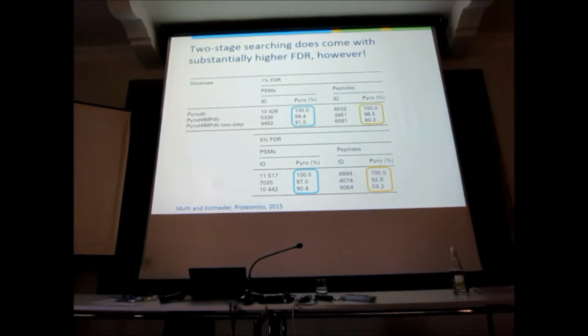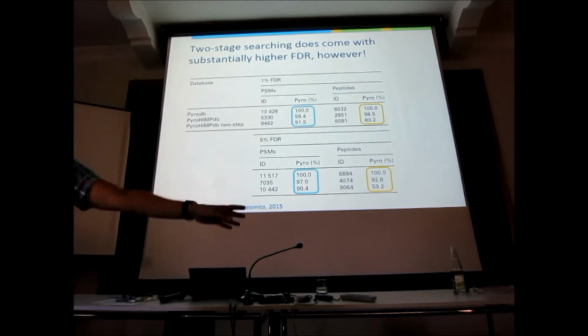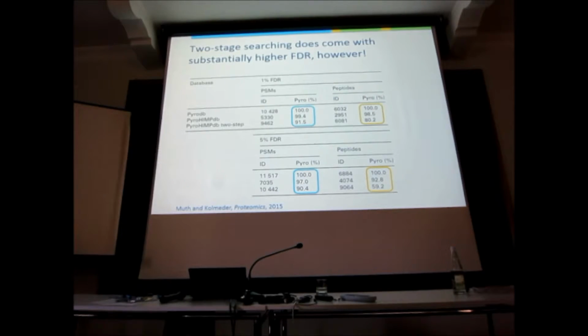our FDR. At the peptide level, this is peptides, we're not talking proteins yet, this is now 20% FDR. Because a lot of these hits, these 8%, they are scattered randomly across all possible peptides. They're not multiple spectra against the same peptide. So this problem balloons at the peptide level. That's pretty dramatic. So have we done any magic? Yes, it's black magic and it took our soul with it.